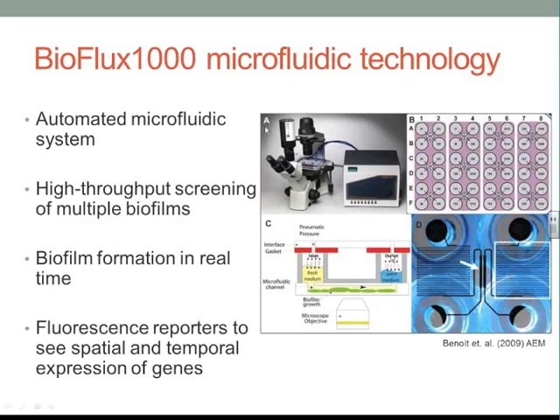In panel A here, this is just a basic view of what the system actually looks like. I'm sure many of you know this, but just to describe it a little bit, we have the pump here on the right that's connected by tubing to an interface that actually sits on top of your plate. And this plate sits on an automated stage, and it can be calibrated and connected to the camera, and you can tell it where to take pictures through an extended period of time.